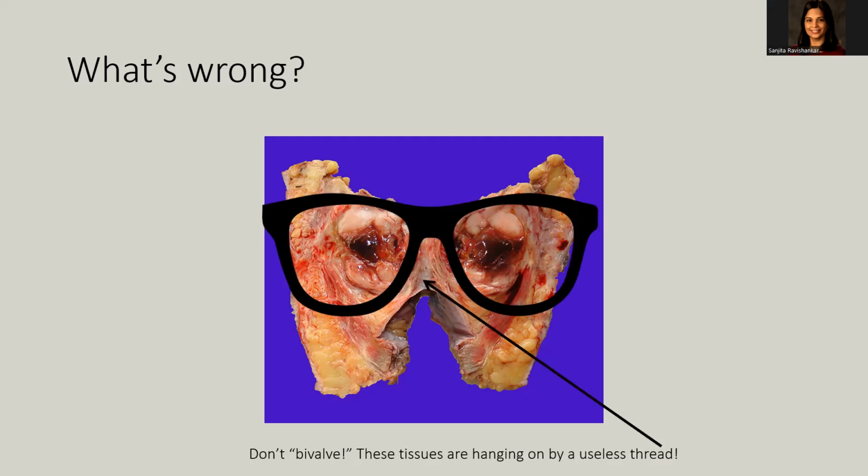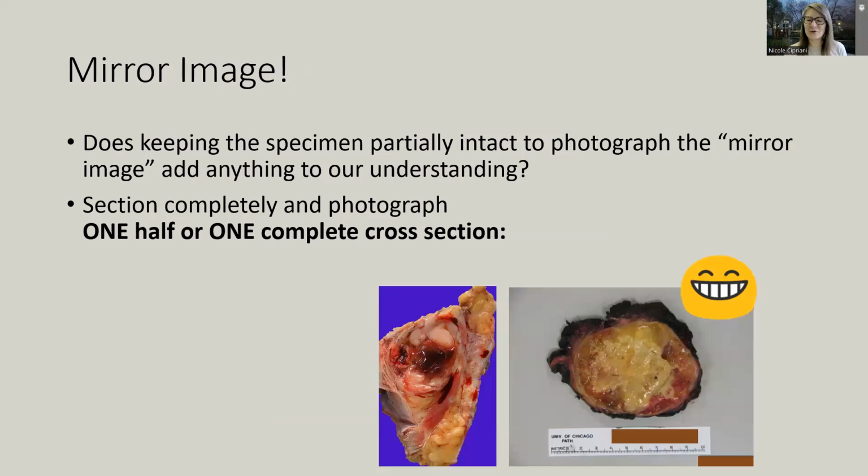Oh my God, I just want to take some scissors and finish the cut. It's so close. Thank you for saying that. Boom. You're just like, exactly. So, does keeping this mirror image partially intact actually add anything to our understanding of the specimen? I would say no. Just cut through it.